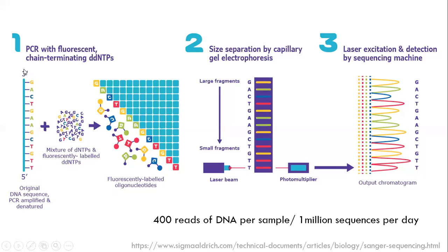Remember that you have the same template DNA from the beginning of any reaction in vitro. One tube will have the same DNA. When these ddNTPs stop this reaction at varied lengths, for example, they may stop the reaction by attaching to the thymine here. Because you are going from this direction to this direction, if they stop at the T here, you have a DNA of 4 nucleotides only. That may be here, that may be here, only T, a combination of 1 plus 3. So you may get an extension of only 4 nucleotides, given a sample of the same length.